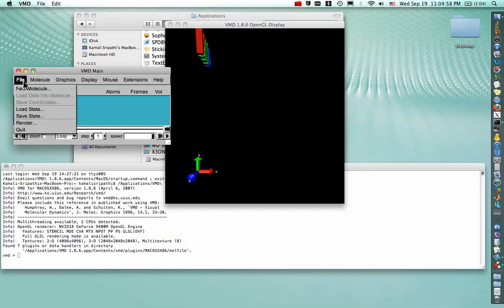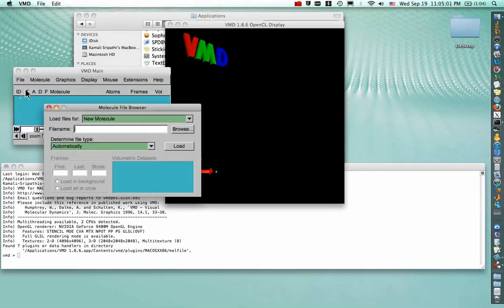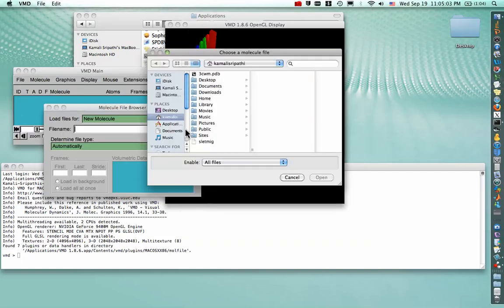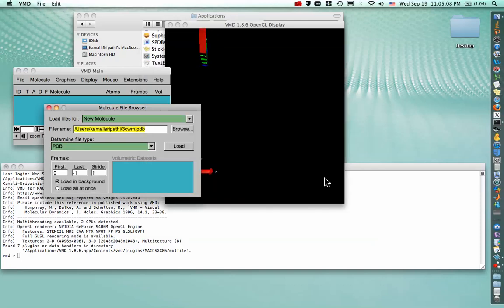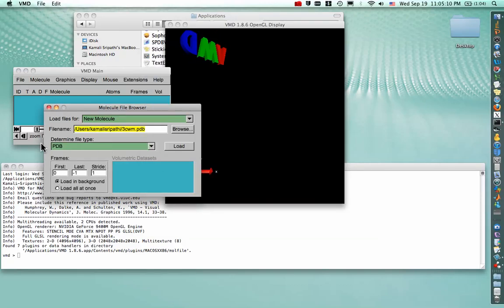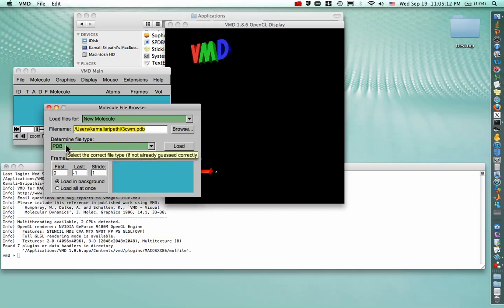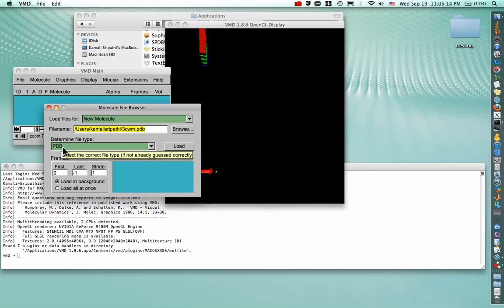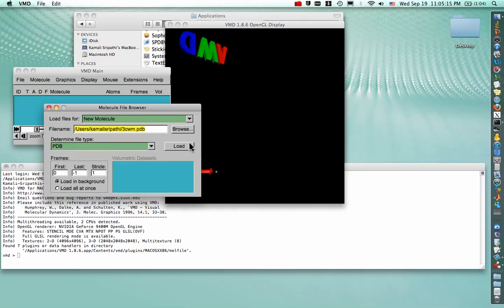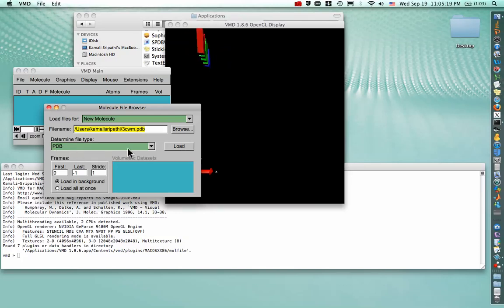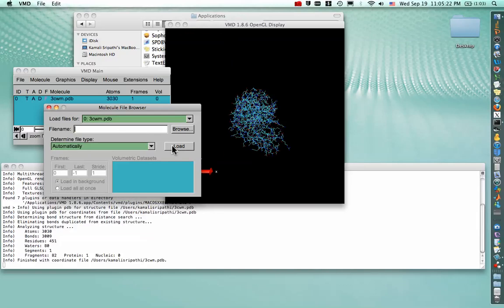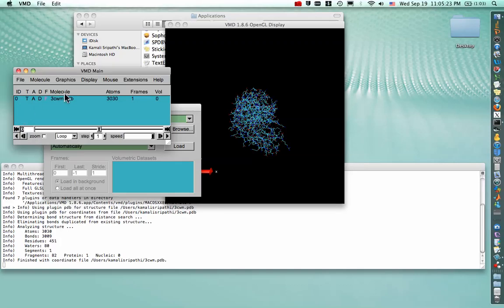So to open our structure in VMD, we go to New Molecule, hit Browse, and there's our crystal structure waiting for us. Say Open. And then just check that the file type is specified correctly in this drop-down menu because sometimes VMD gets it wrong. But in this case, VMD is right. So we can just hit Load, and then our structure will show up in the VMD main menu.